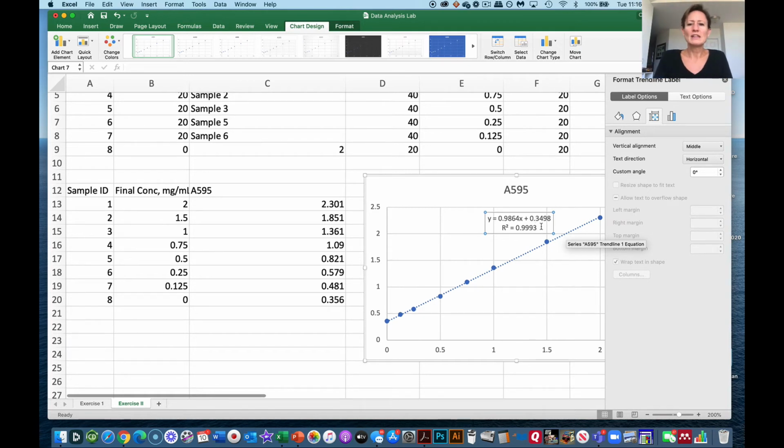This equation really allows us to relate and equate an absorbance value, which is our y parameter, with our concentration, which is our X parameter. So this really is a two-variable equation. To make this chart, what we did is we used known X values, known concentrations, and we experimentally measured Y, which is the absorbance.